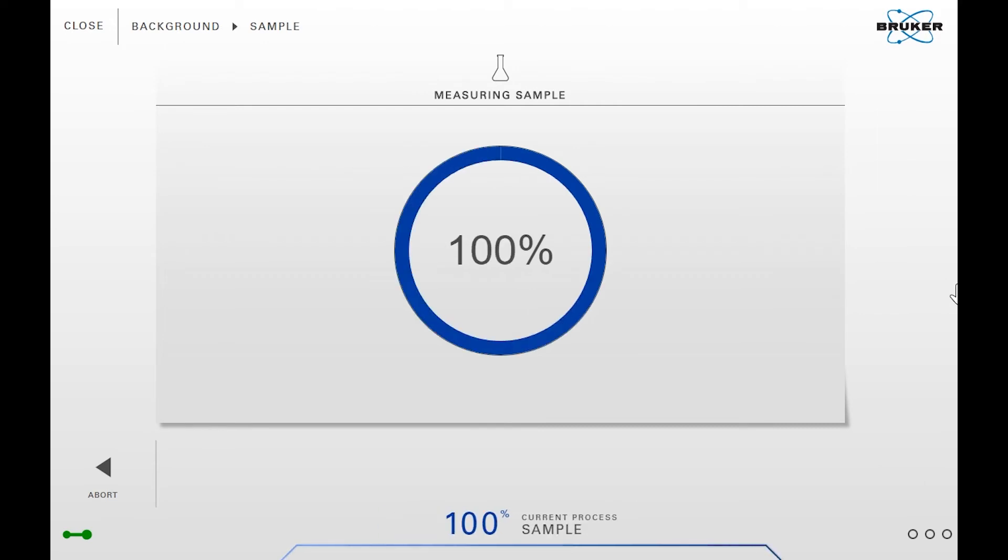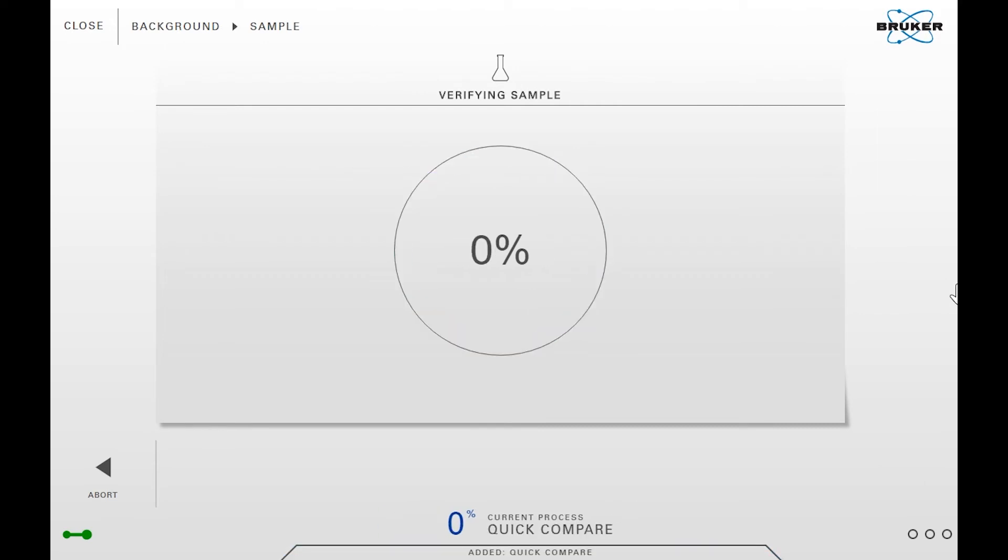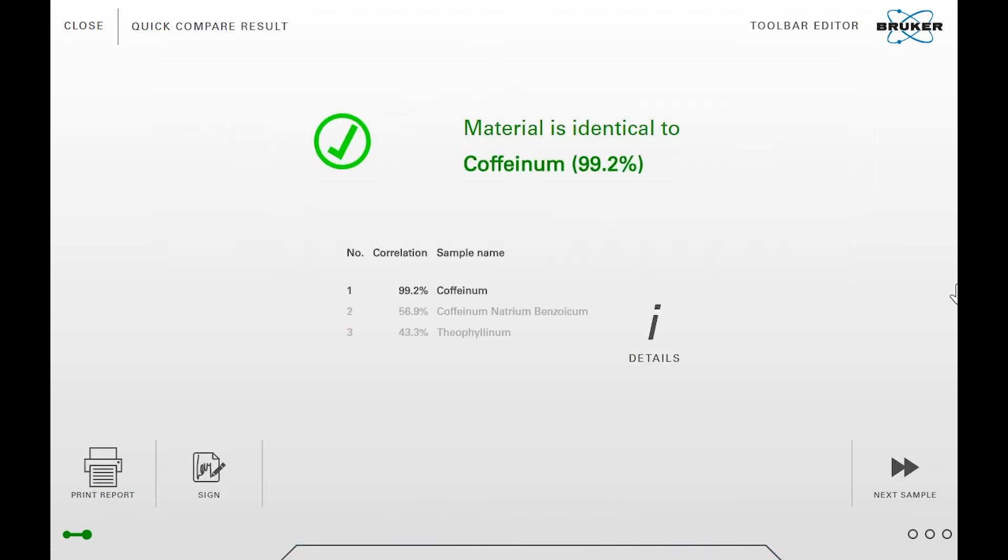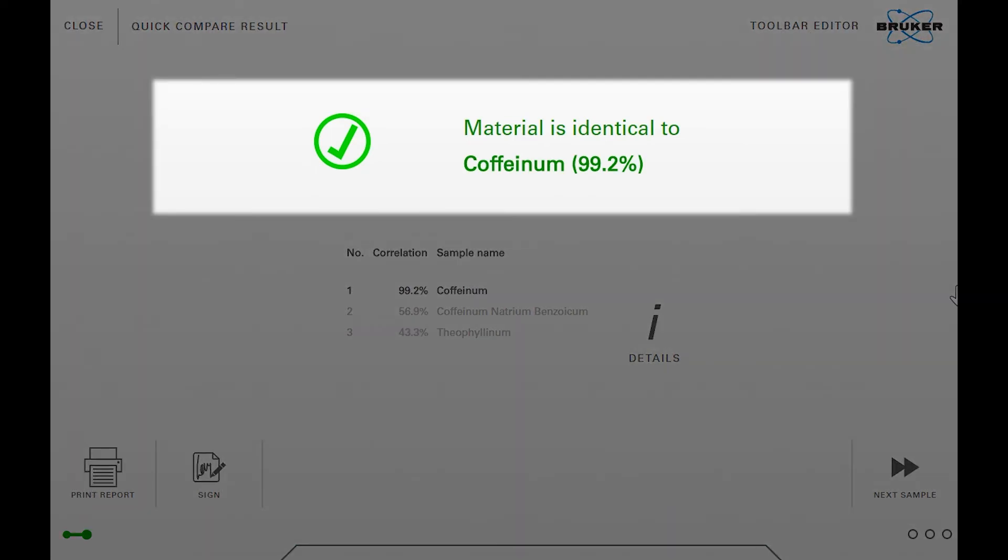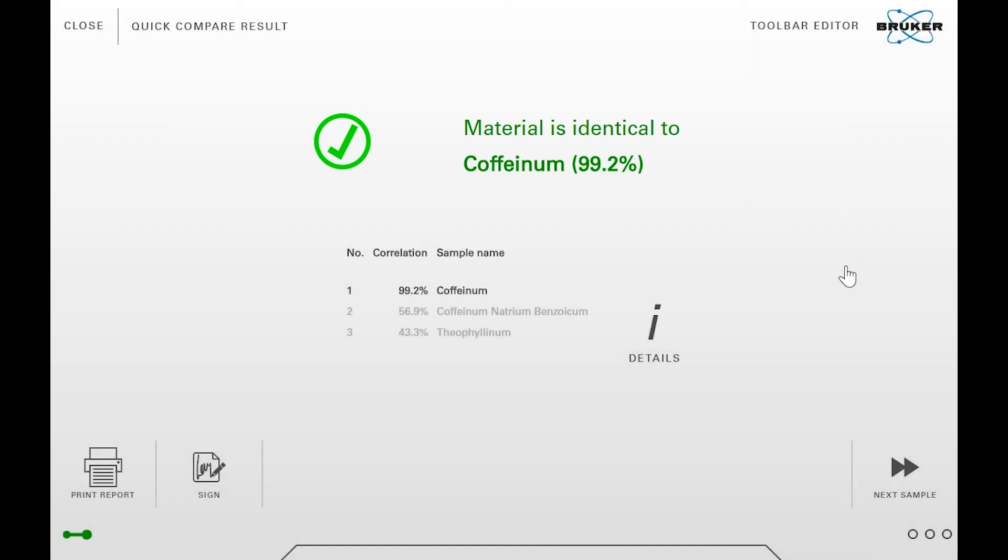When the measurement is done, the previously selected quick compare method will be automatically performed. Now you can see the result of the quick compare. Here we have a green result since the selected substance was successfully identified.